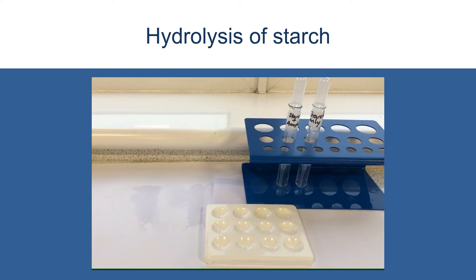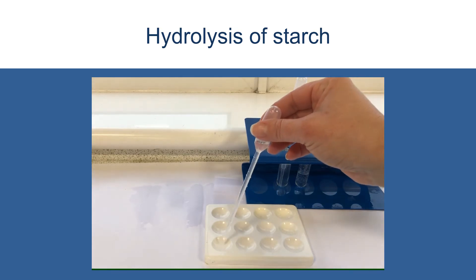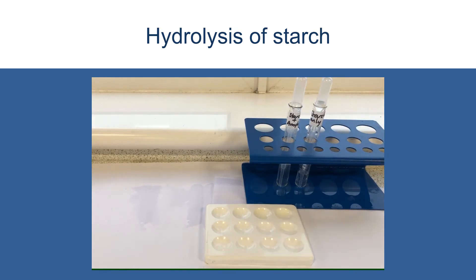And now what I want to do is I want to check has anything changed in that time. So before we do anything I'm going to test for starch only. So we're going to put a little bit of that there and we're going to add some iodine solution to it.